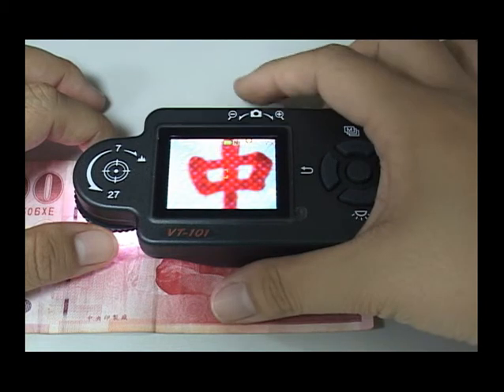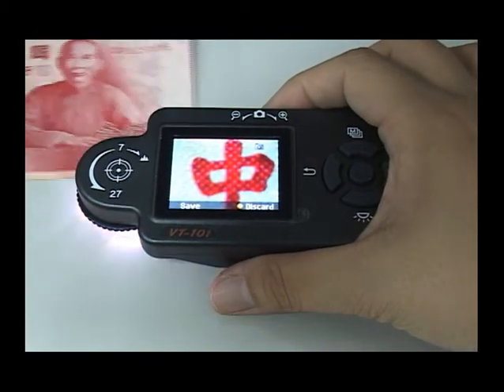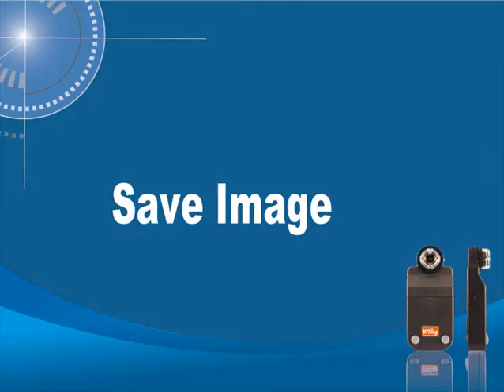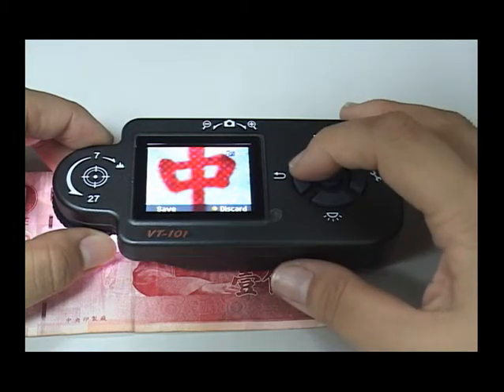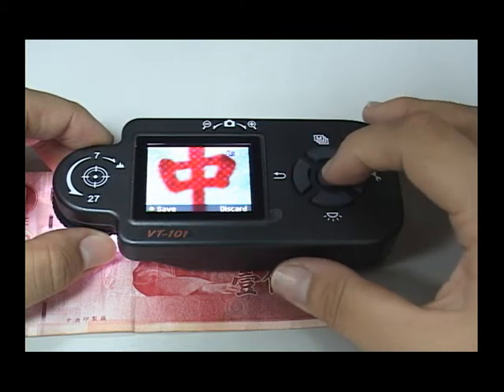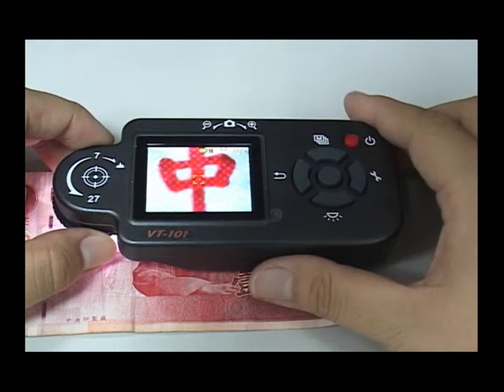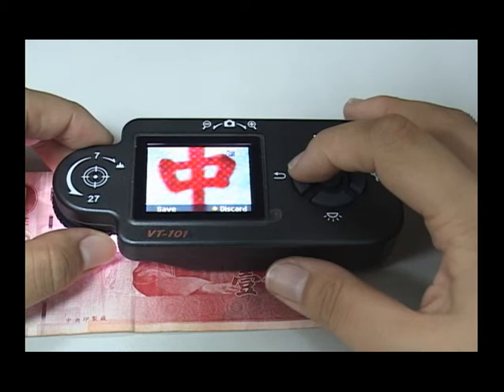Press the snapshot button to take a photo. After freezing the image, the microscope will ask you if you want to save or not. Press the middle button to save the image in memory. When the screen temporarily stops, it will show the available number of saved photos at the top right.